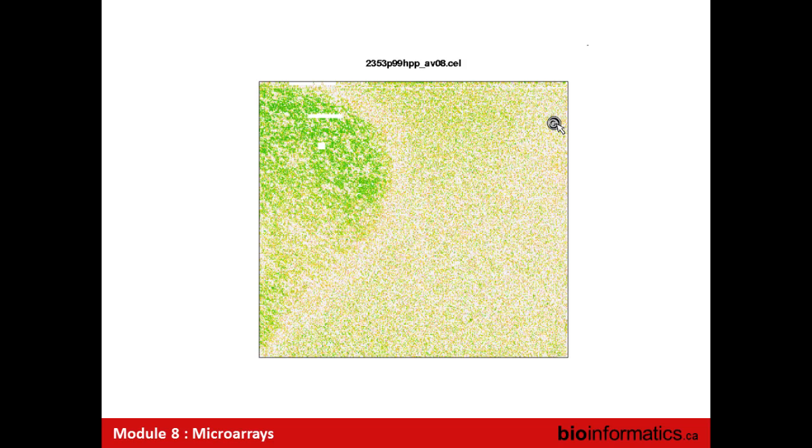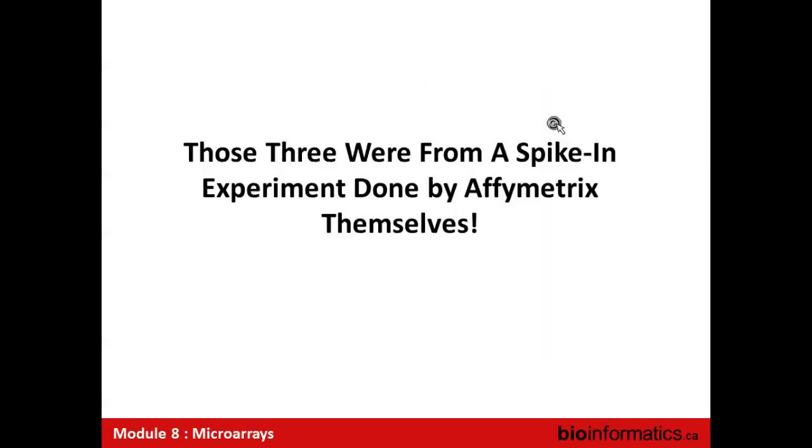So you'd say, that's fun. Oh, those can't possibly be a good Affymetrix array experiment, but those are from the standard Affy data set done by them themselves on their website that we can go and use as the exemplar for the best quality Affymetrix data that you should use for designing studies. That's a good example of it.